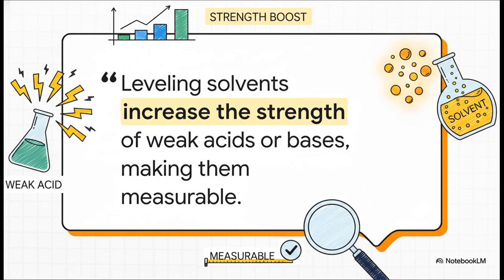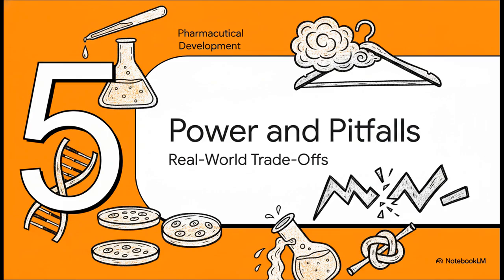And that's the whole point. The solvent isn't just a background setting anymore. It's an active participant. It literally increases the strength of the weak acid or base, leveling the playing field so you can finally measure it accurately. This whole technique is a massive game changer. It's used everywhere from making medicines to the chemicals in dry cleaning. But, as with any really powerful technique, there are some pretty serious trade-offs.